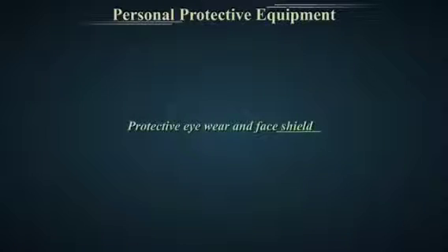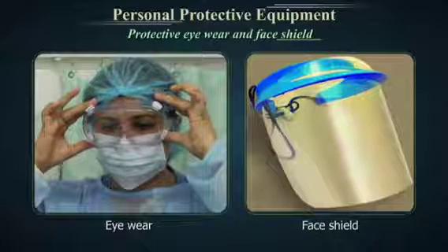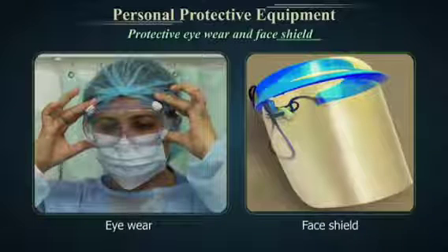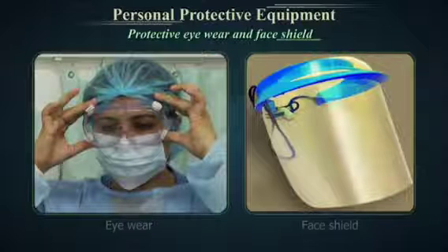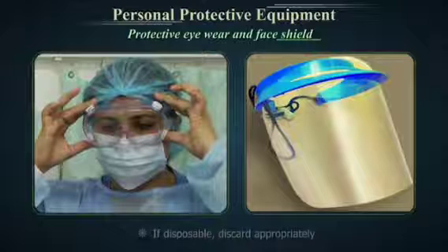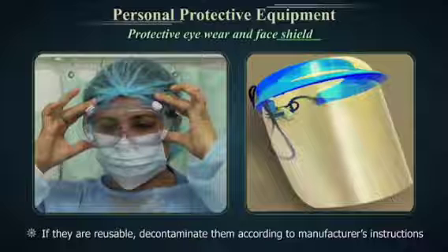Protective eyewear and face shield. Wear protective eyewear and face shields to protect the mucous membranes of eyes when conducting procedures that are likely to generate splashes of infectious material. If disposable, discard appropriately. If they are reusable, decontaminate them according to the manufacturer's instructions.